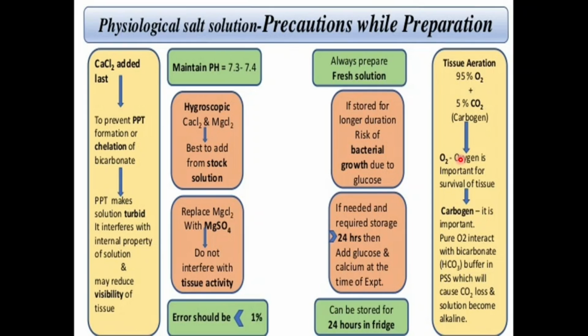You know that the tissue which you are studying is placed in the physiological salt solution, which is also known as the PSS. So the oxygen, if you give the oxygen, will react with the bicarbonate which is present in the PSS, and that reaction of the oxygen with the bicarbonate in the PSS will result in the liberation or the removal of the carbon dioxide from the PSS.